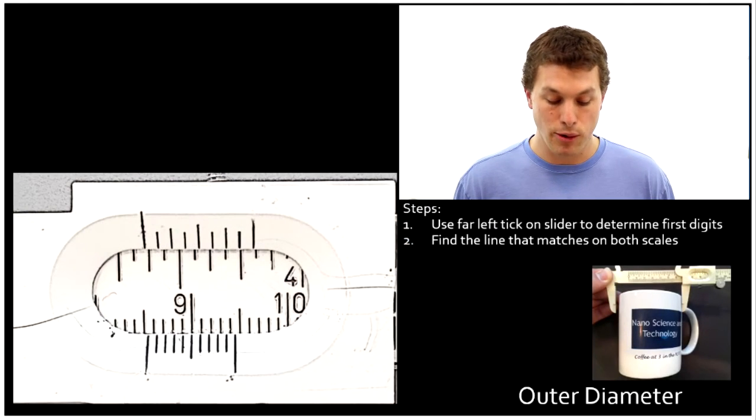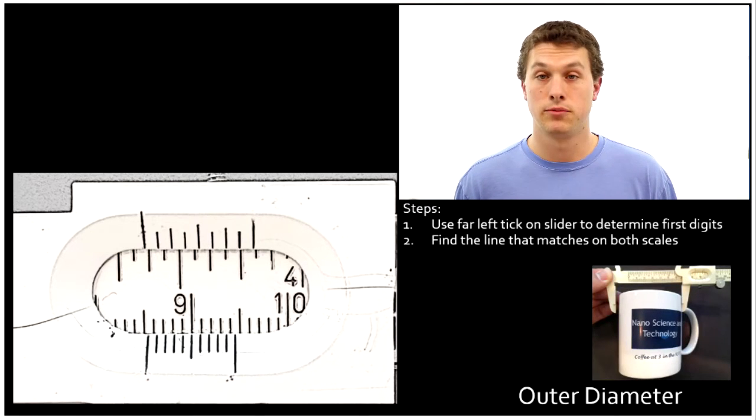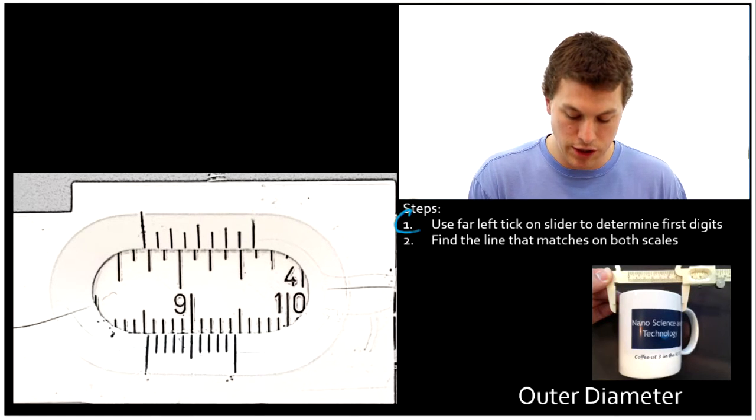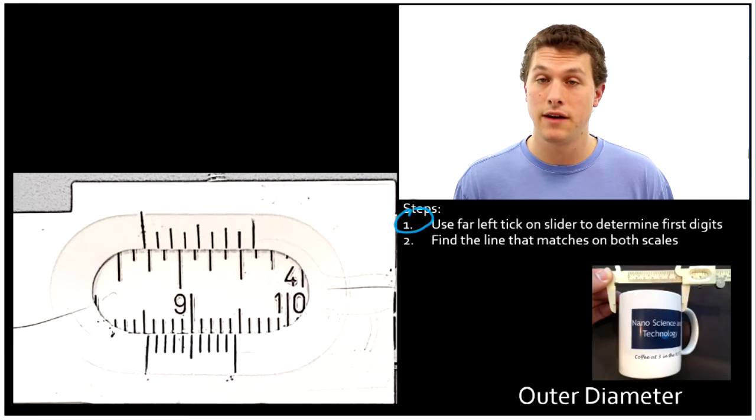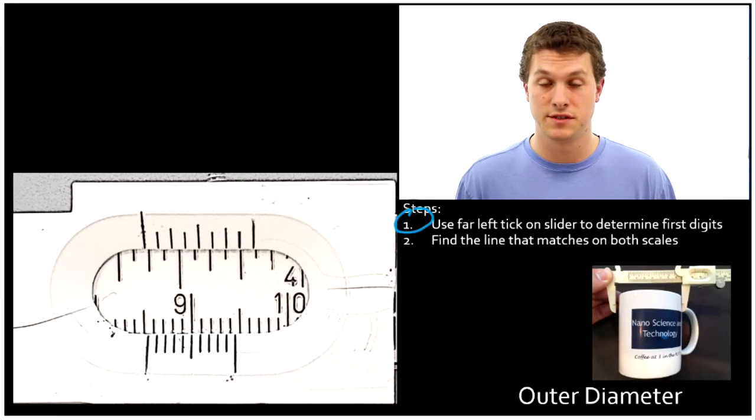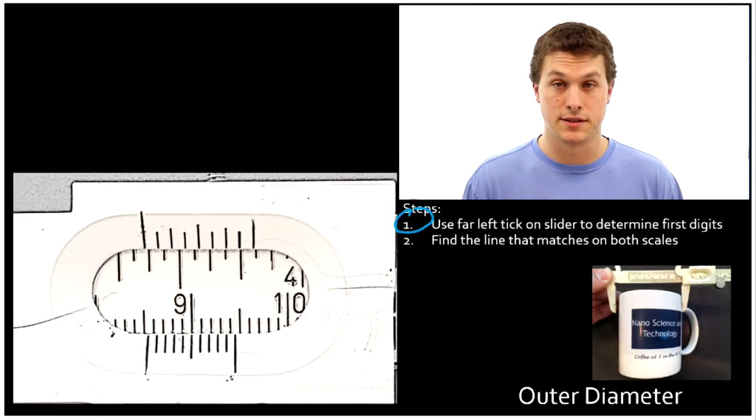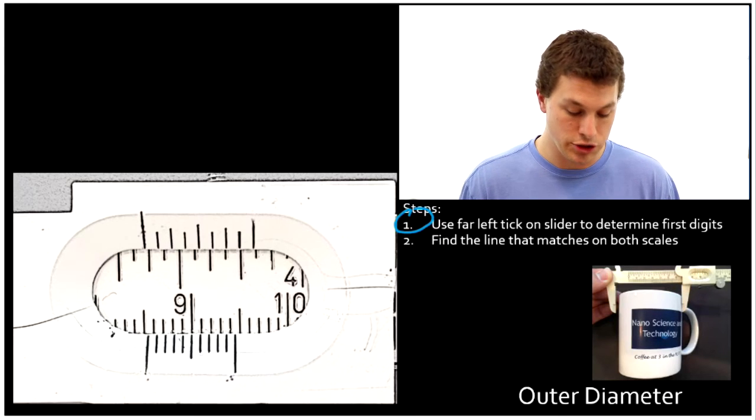Here we're reading the outer diameter of our coffee mug. There's two steps really to reading these calipers. First, we want to use the tick on the far left of the slider, that is on the vernier scale, to make our initial measurement. We're going to read our first few digits that way, and the very last digit we're going to read with all the ticks on the slider.